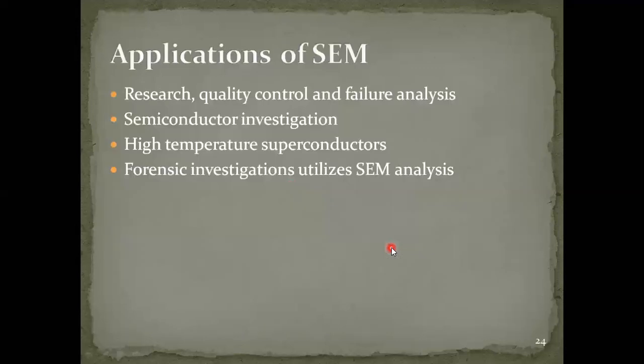Previously we discussed that if you want to prepare CuS, by using XRD we can know the phase, whether it is CuS or Cu2S or Cu2S3 and so on. That is the phase identification we have been using there. But what is the composition? You have prepared CuS.